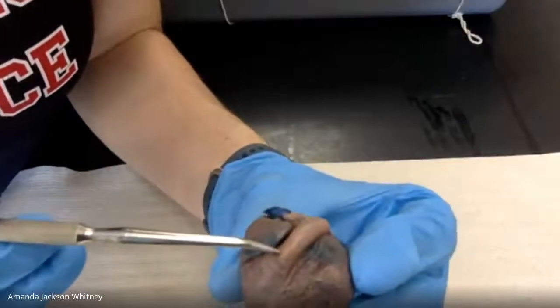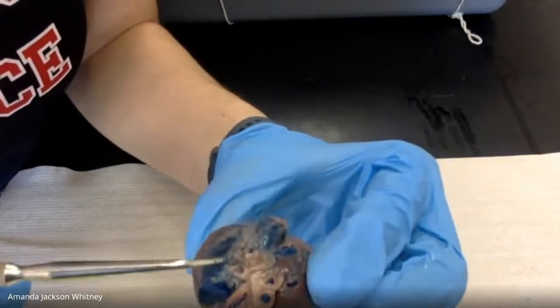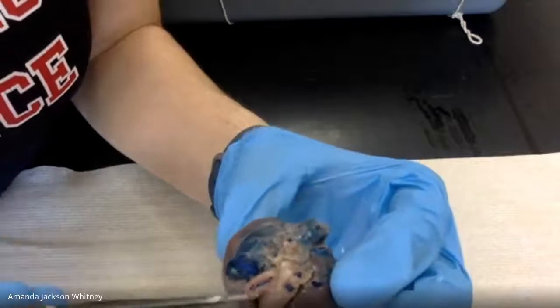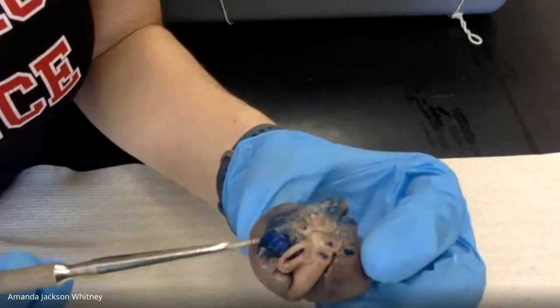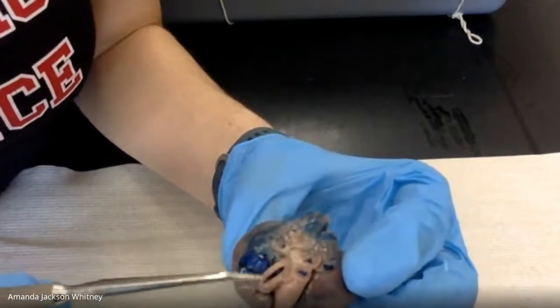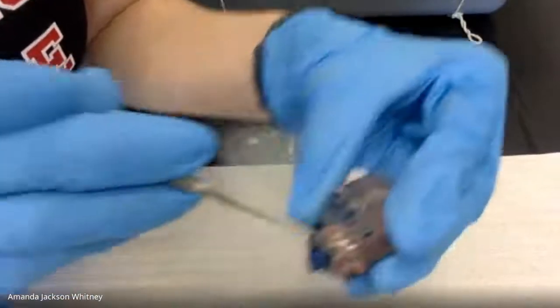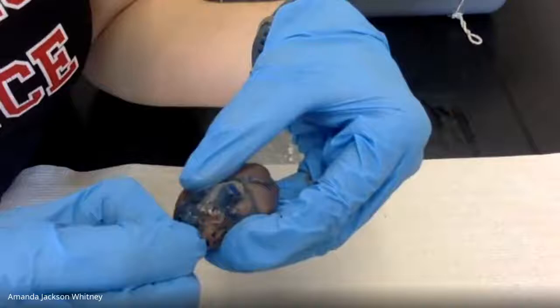And then we have some blood vessels here that I'm going to rotate so you can see everything from the, maybe like the human superior, but the pig anterior side. So you can kind of tell here, this is one of the main blood vessels that's going either towards or out of the heart. And so is this one. I know it's really hard to see because it's on a tiny little camera and you've never seen this before.